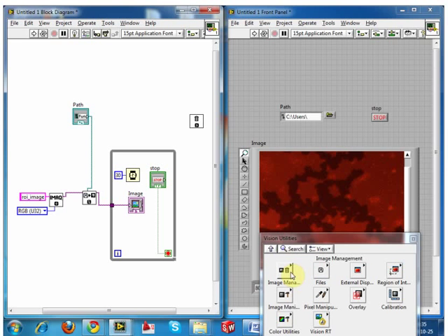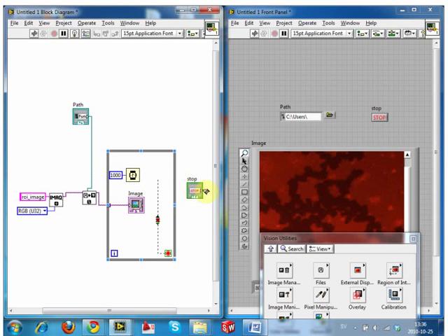Hey Kevin? Yep. Can you put the stop button outside the loop later to show the difference? I can do it now. Well, yes, let me slow it down. So if I do it like this, as this loop's running, like you saw, it will read information from the edge of the loop inside the loop. So by the time the data gets to here and it's running around here, if I push a button outside of the loop, it doesn't read it because it's not inside the loop. So it will keep running around this loop until this value goes to true.